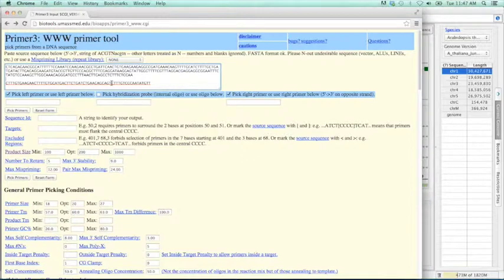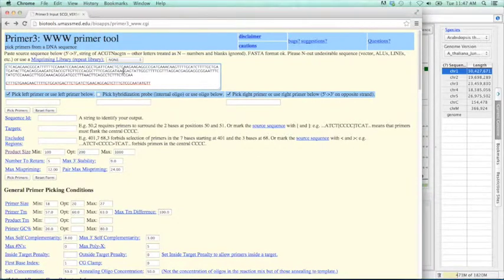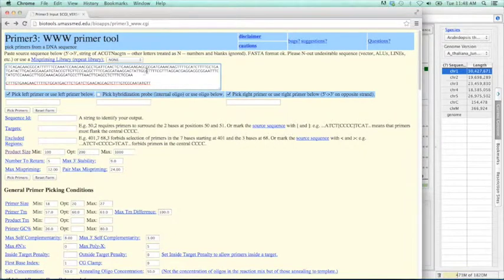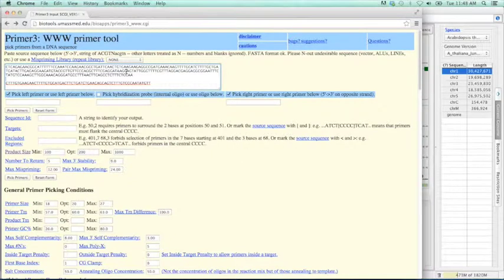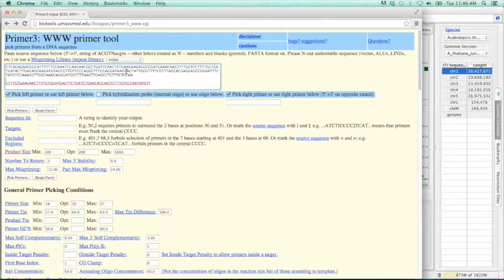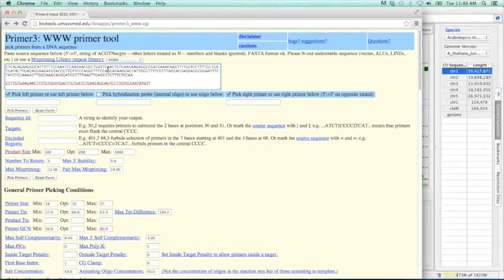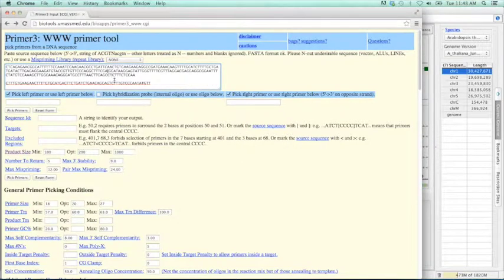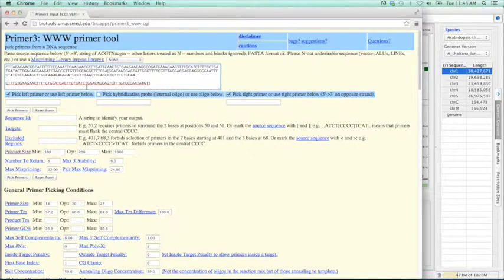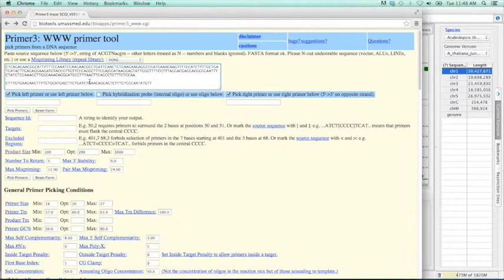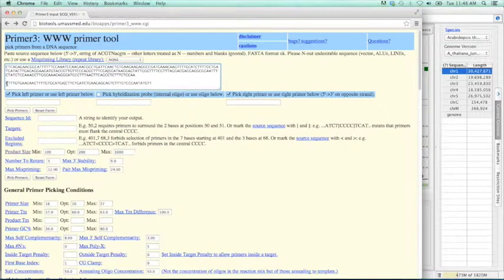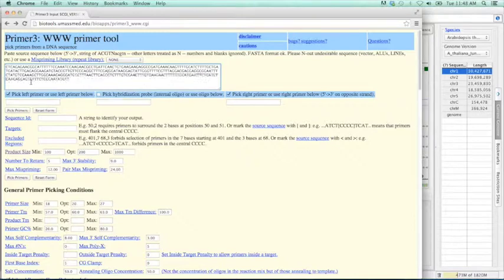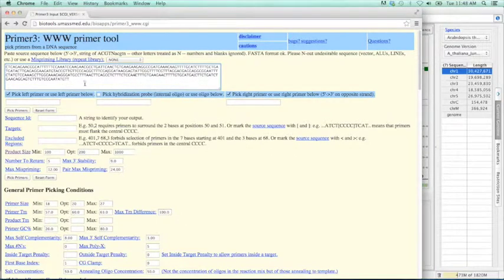The way Primer3 works is that it's going to design primers around a region that we define. In order to define that region, we use brackets. So if our exon is excluded, we still want to get a product size that is at least a couple hundred base pairs. In this case, I'm going to put a left bracket somewhere in the middle of this first exon. Right here. And then similarly, I will put a right bracket in the right flanking exon. Put it right here. And now I'm going to get rid of this space.